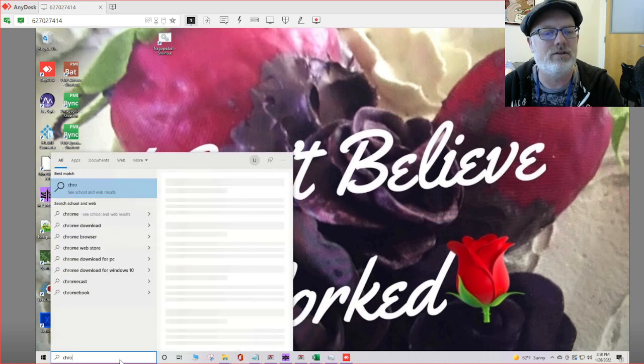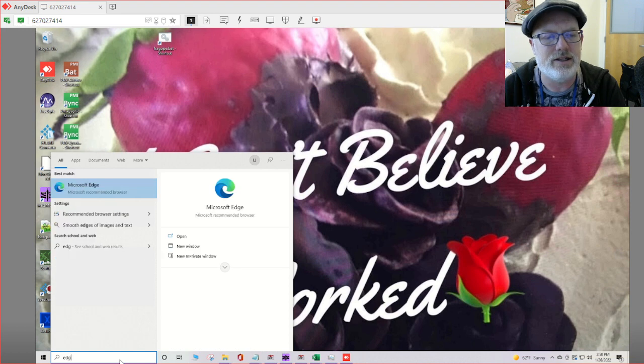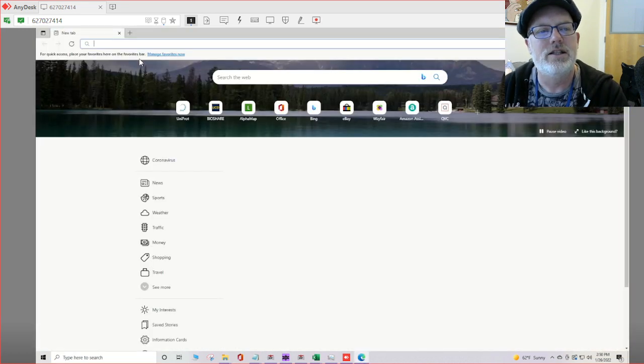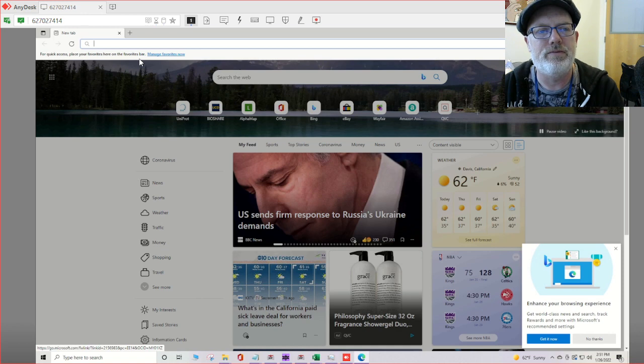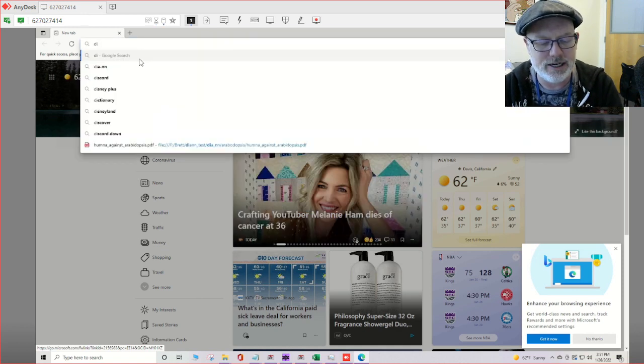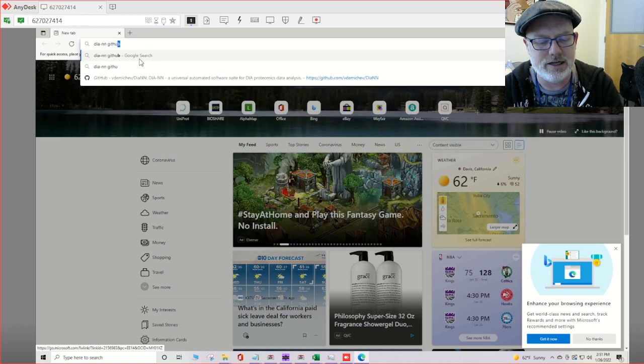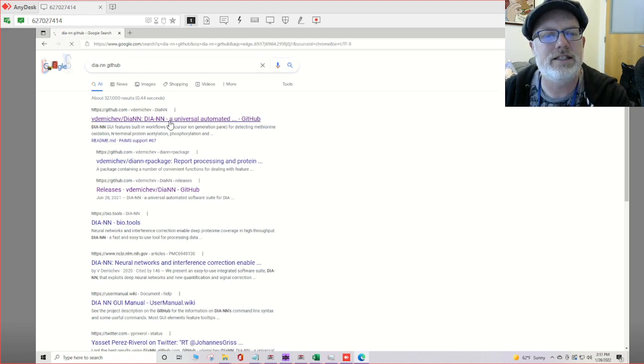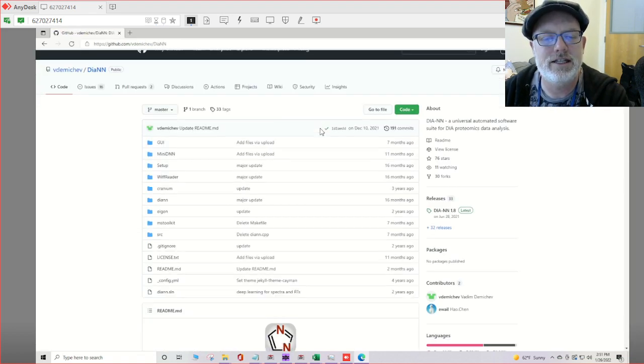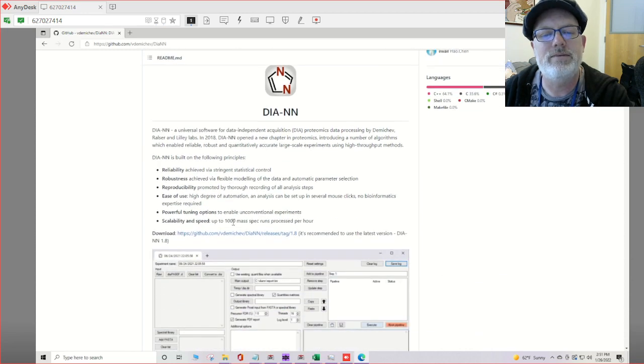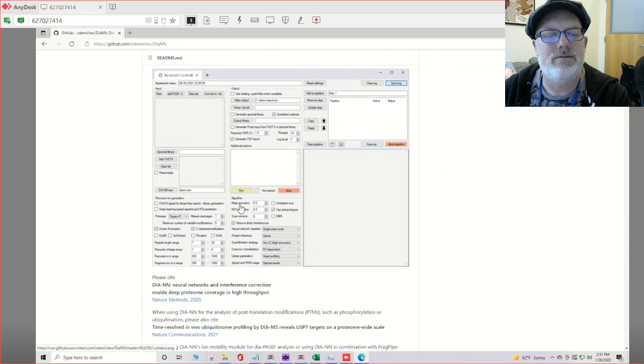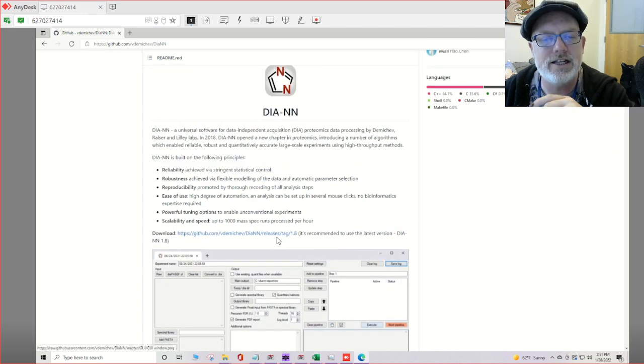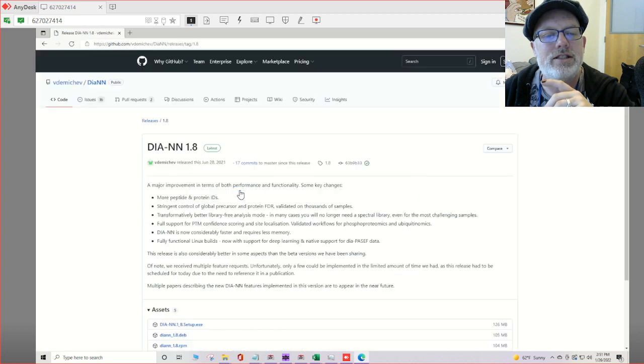First we will open our browser. So open your browser, Google search DIA-NN GitHub, and you will find the DIA-NN site. This will tell you a little bit about it. There's a great manual. This is usually the most sensitive way to search your DIA data. Click this to download it.